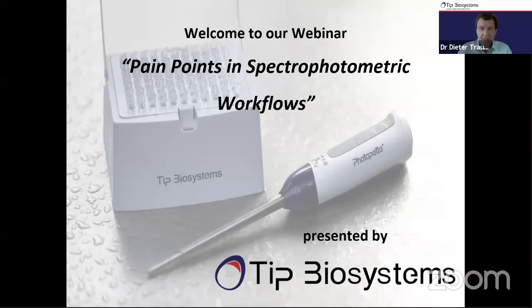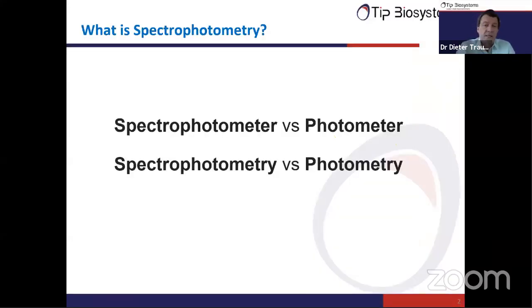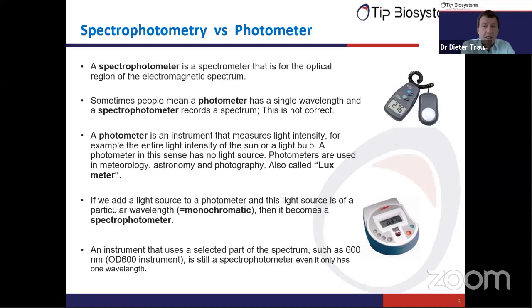Okay, thank you, Merlin. Then let's start with the webinar on pain points in spectrophotometric workflows, where we want to address those that you have submitted, and we also want to introduce you to a new type of spectrophotometer and workflows that you may consider in your company or in your studies. So let me introduce a few terms, as there's sometimes quite some confusion. What exactly is a spectrophotometer, what exactly is a photometer, and of course the techniques, spectrophotometry and photometry. Let me start here very simple.